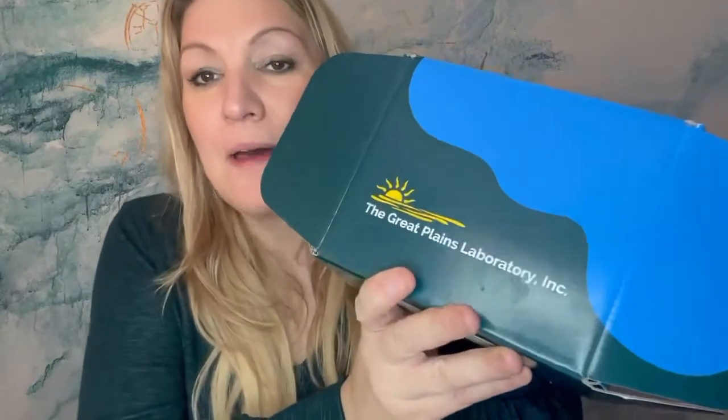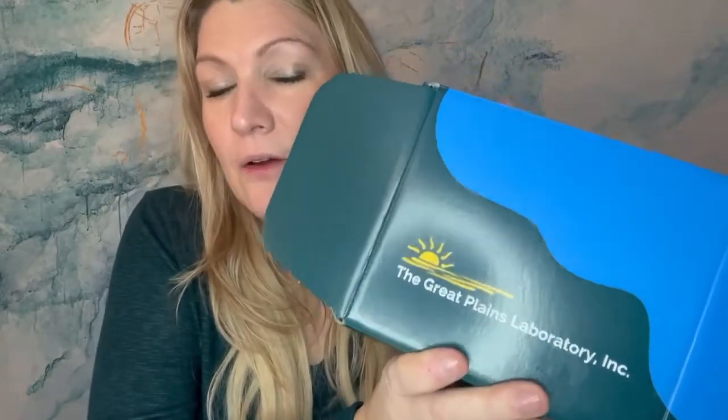You want to ship it Monday through Thursday — don't ship it on a Friday or Saturday because they don't want it sitting very long. I believe it's one or two day shipping. This is the mold Great Plains Lab biotoxin test. We would use this for mold toxicity or, and maybe and, the non-metal chemicals — things like Roundup and glyphosphates and things like that. So that is the first test in package number two. This may be a one-off — you may just be doing the mold test or just the non-metal toxin test.